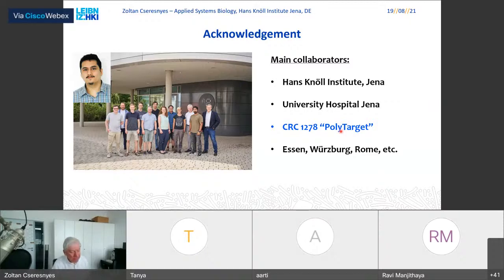Is it possible with this to distinguish cells from the pathogen? For that, you would probably need labeling because the second derivative, which is, like I said, basically measuring the curvature, will not be different enough. Another approach is, if you have a large enough number of images and data, to use a deep learning method to identify, to separate, to classify them. And we also are working on that in our efforts. But otherwise, you would need some sort of counter labeling, basically.